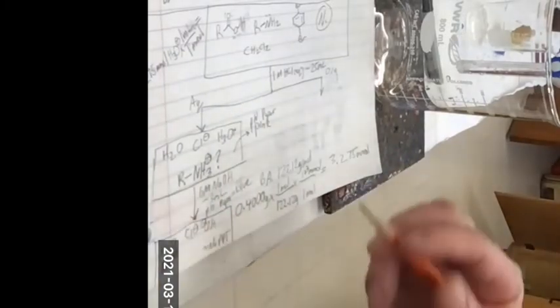So what I'm saying then is that I don't think I have the amine. I think I have an acid. So then over here, what do I have mostly in this organic layer? Methylene chloride. Yeah. What else is in there? You have your acid still. Oh, your acid would still be in there? Yeah, right, the acid, yeah, good.